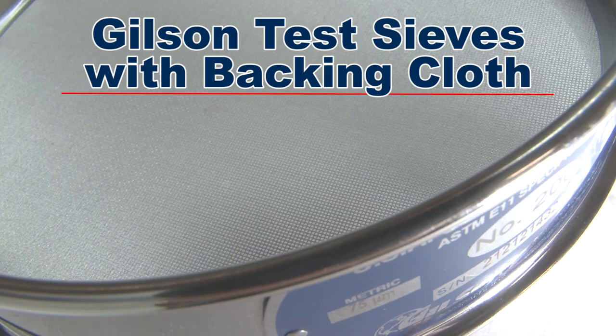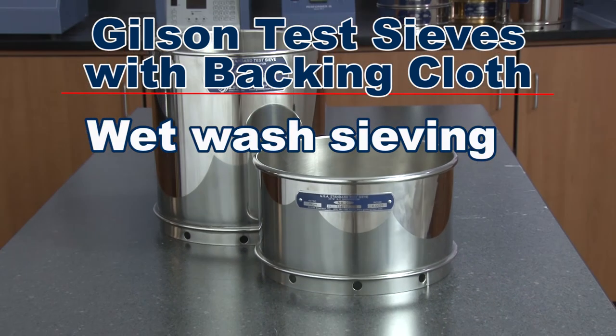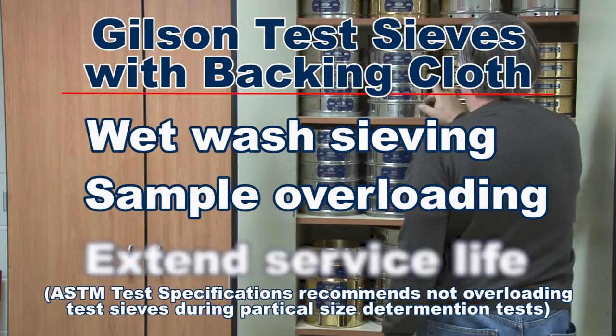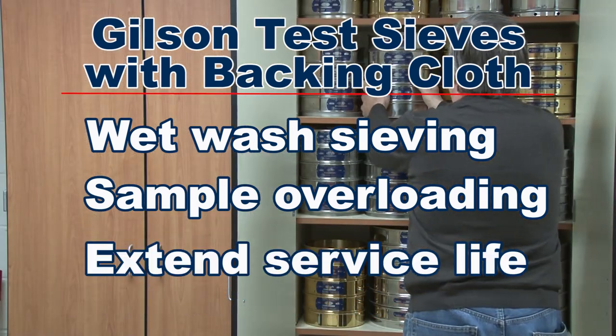Applications where you may want to add a backing cloth to your test sieve include wet wash sieving, sieving applications where overloading occurs, or where you just want to extend the life of your test sieve.